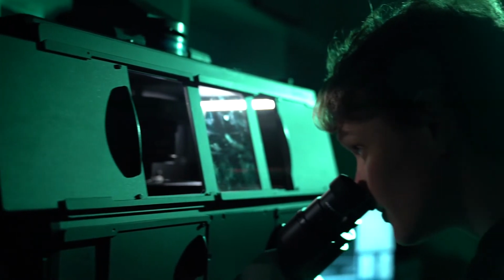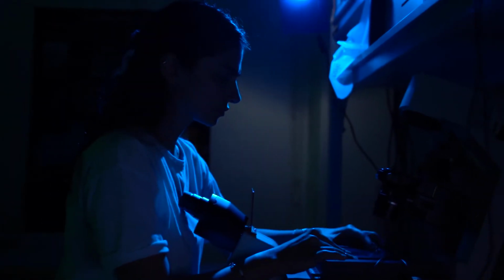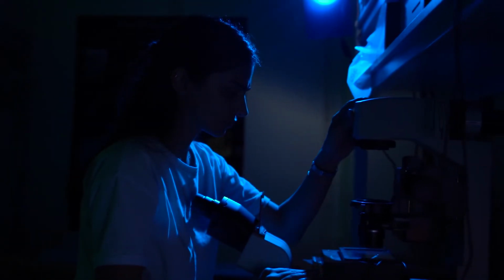We then used specific microscopes for each experiment in order to record cells and filaments. These structures grow and move slowly. They were recorded during hours and days and then accelerated to make movies. Finally, those movies were projected onto the original building in the center of Paris.